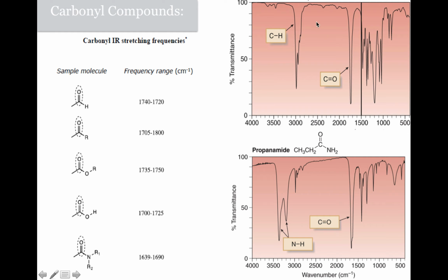So on the right side of the slide, the IR spectrum shows maybe it's a ketone or an ester, because it has a strong carbon-oxygen double bond around 1700, and below 3000 it has CH, so it possibly doesn't have an aromatic ring.